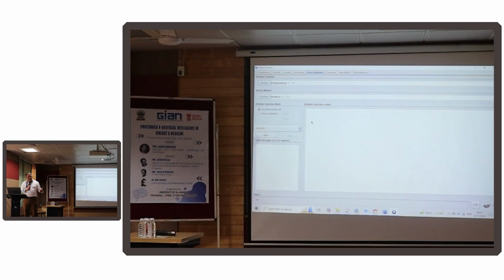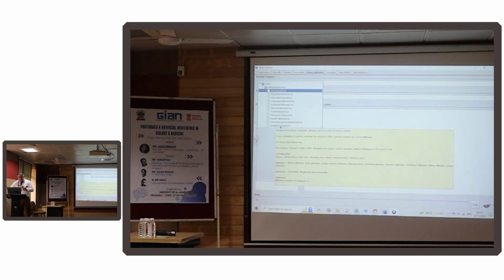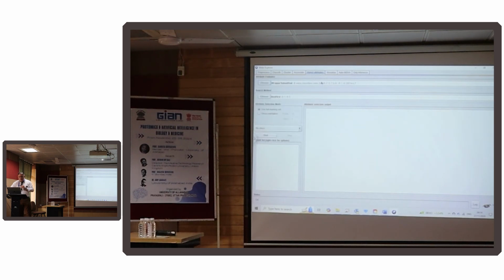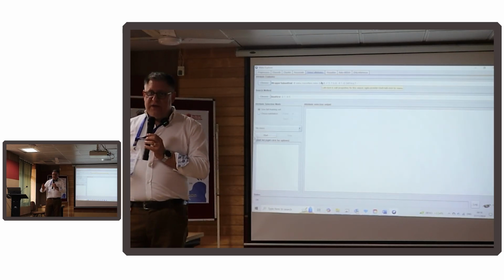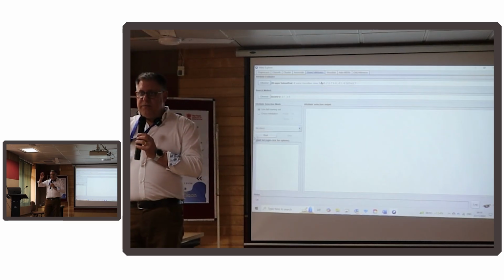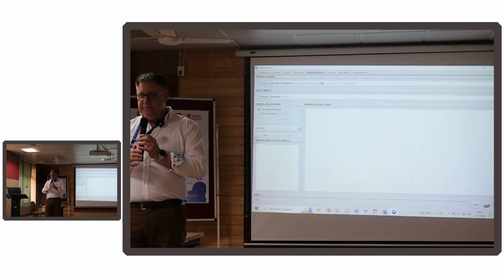It's this parameterization that we can use. So I'm going to choose the attribute evaluator and check the wrapper subset evaluation. A wrapper method basically uses the performance of an algorithm to select parameters.